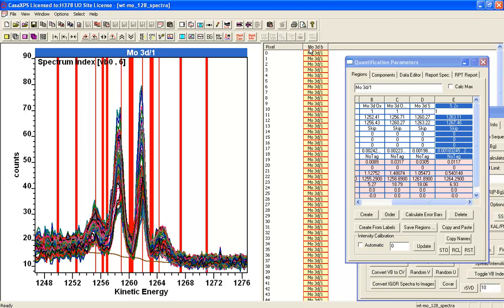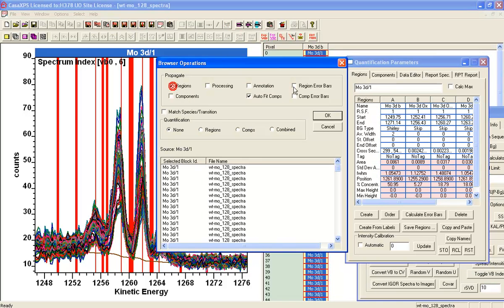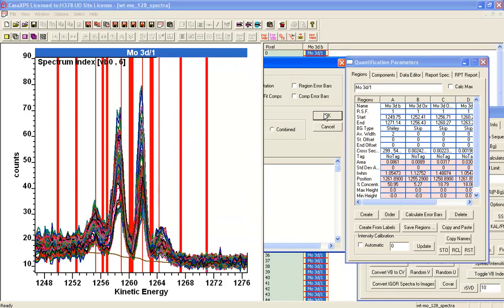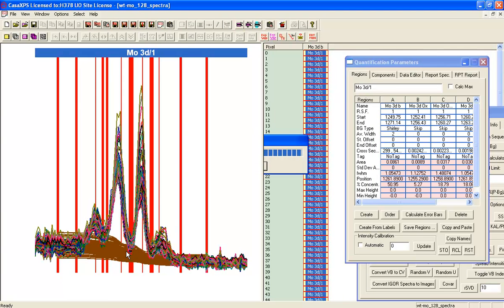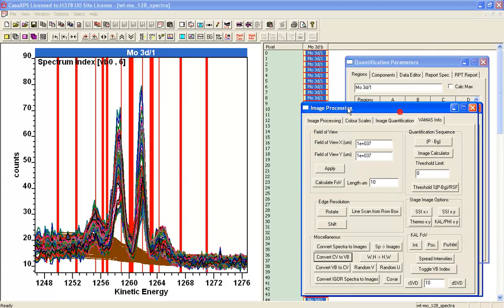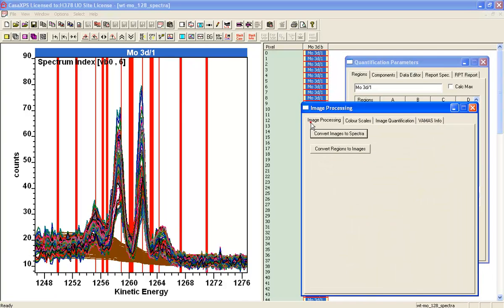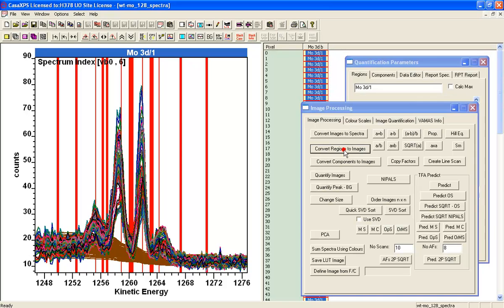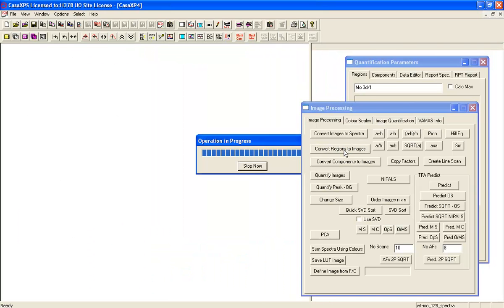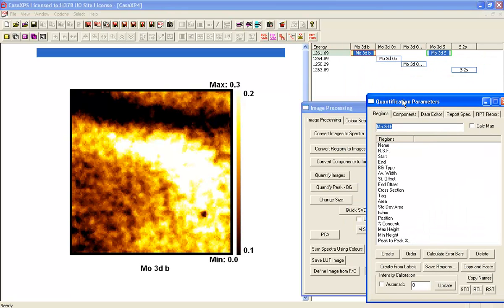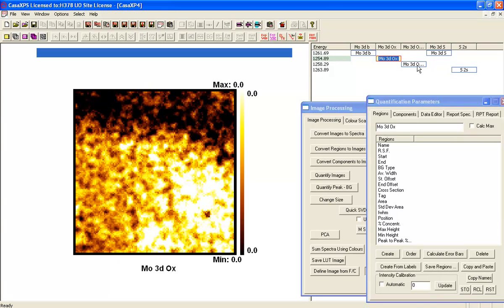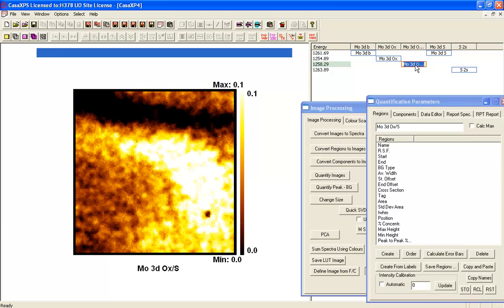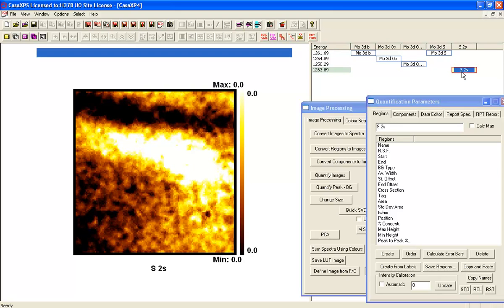If I now propagate these regions to all of these VAMAS blocks, I get a background. And I get these regions on each one of these VAMAS blocks, which I can then use to create images. So for each region that I've got defined here, I'm going to create an image. And from these images, I will be able to create atomic or other percent area images. So let's convert regions to images. Now we have a set of images. We've got one for each region that was defined. This one's the total. This is the oxide. This one is the combination of oxide and sulfide. That's the sulfide. And that's the sulfur 2S.